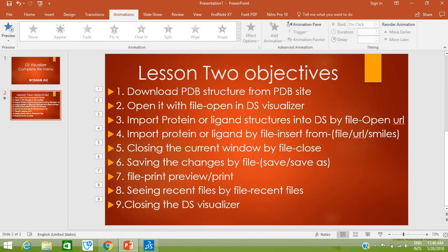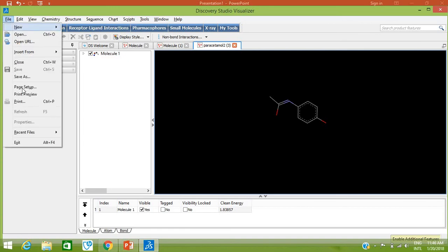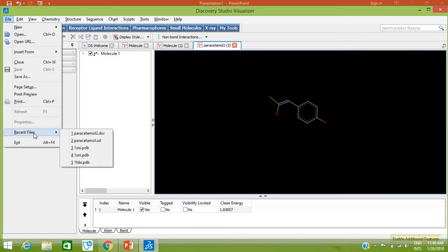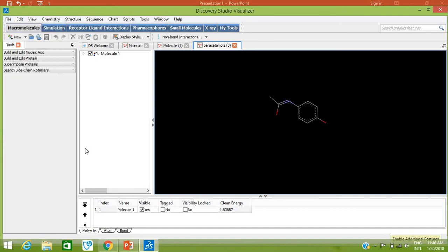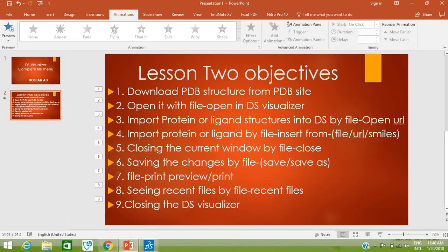The eighth objective is seeing the recent files that have been opened. Go to File > Recent Files. These are the recently opened files: paracetamol (two versions we saved) and 1ZNI. You can just click on 1ZNI and its structure will be opened in a new window.